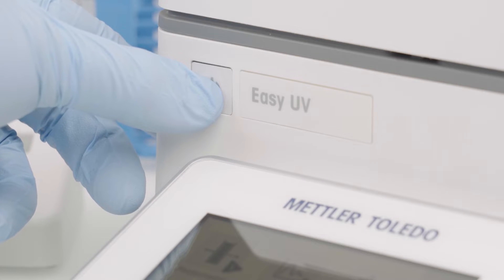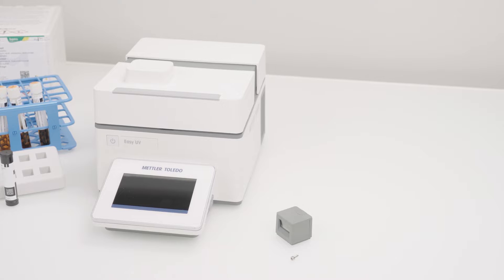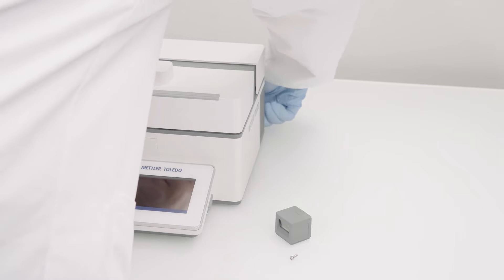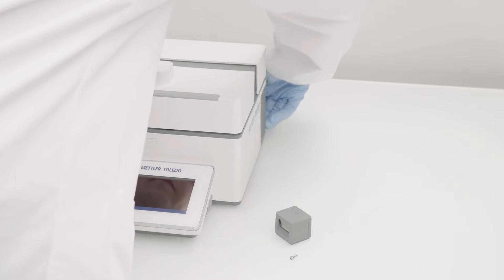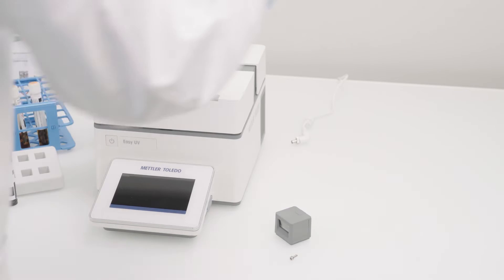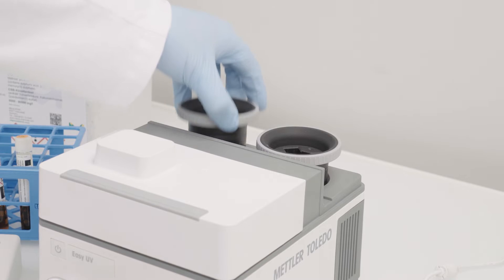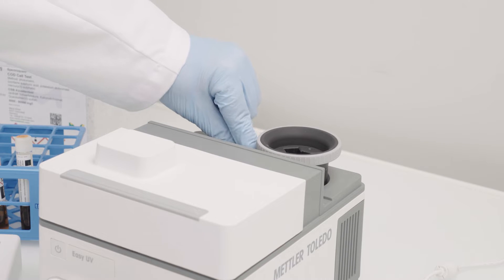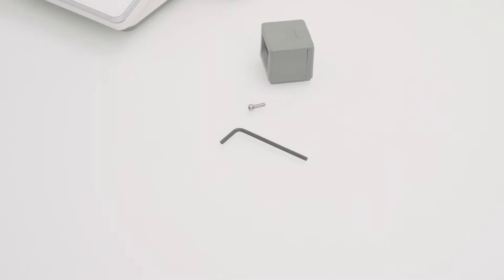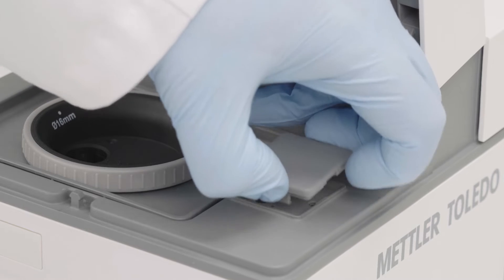First, switch off the instrument and unplug the power cable. Take the allen key from the storage compartment below the back cover. Open the lid and remove the shown cover.